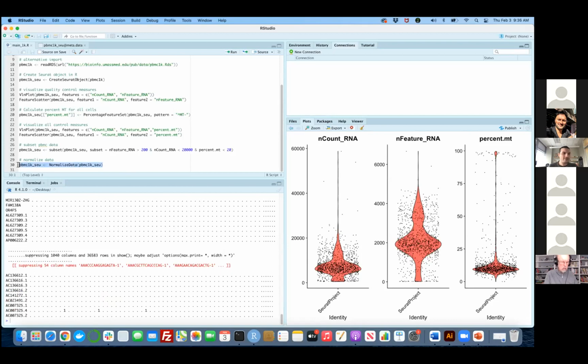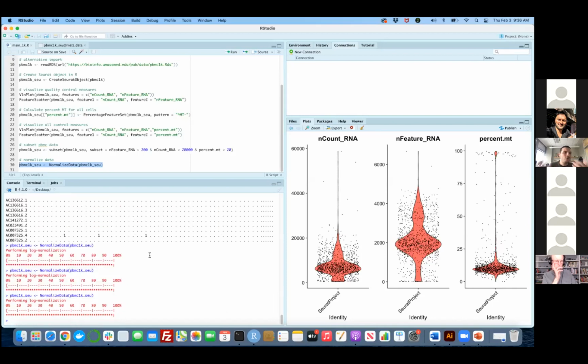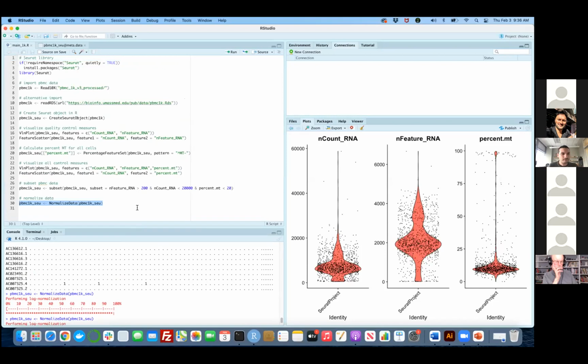The fun thing with Seurat is that you can keep running the same code, and you're not normalizing data that you have already normalized. It just takes the data from counts and points to the data, but nothing really happens. Nothing is actually changing. This is really nice. If you confuse the order of the functions, sometimes you need to start from the beginning, but in this case, for a lot of functions, you don't really have to. Okay, so this is where we left off, right?